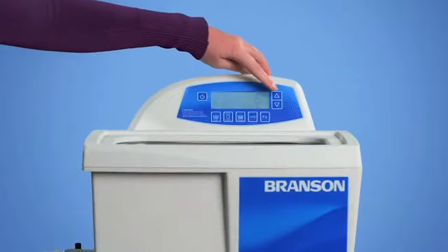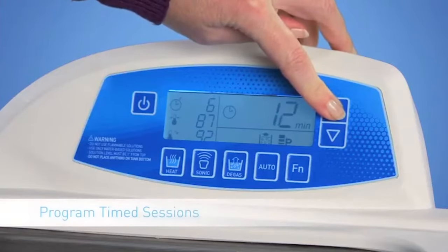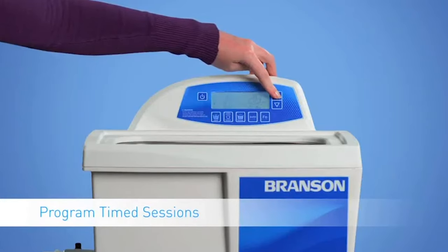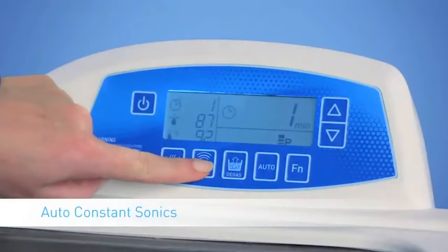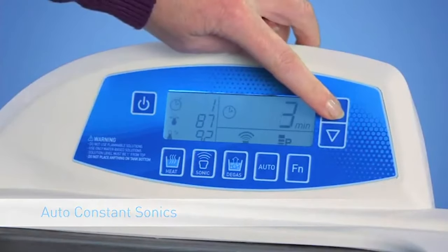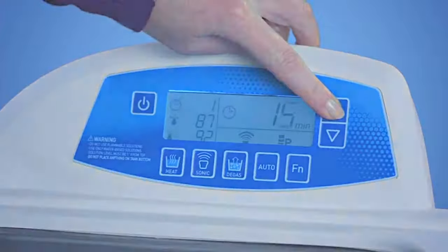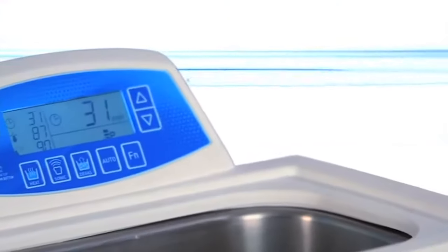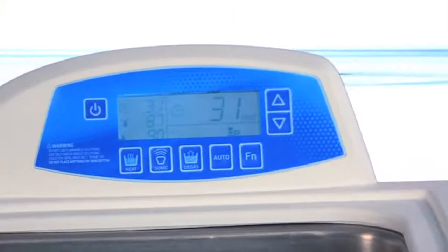Start by setting your cleaning time. You can choose timed increments of up to 99 minutes, or get the flexibility of continuous cleaning with the Constant Sonics mode. Either way, just set your digital Branson Sonic and forget it. The new digital series of Branson Sonic Baths ensures the most consistency from batch to batch.